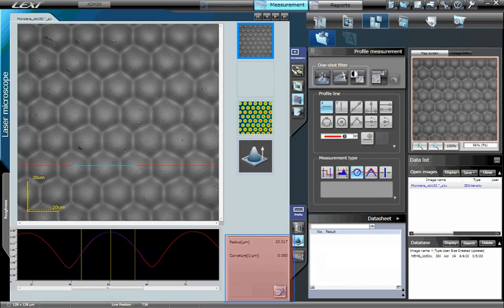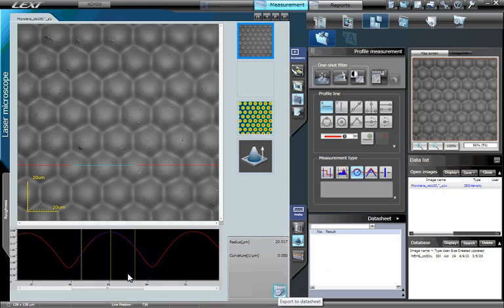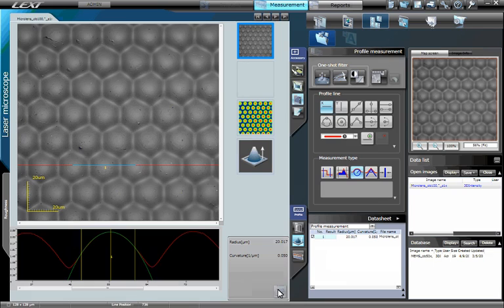The radius and its reciprocal value curvature are displayed and updated dynamically as the yellow target lines are moved. As demonstrated earlier, click the button Export to Data Sheet to save the data where it can be exported via CSV format, Microsoft Excel, or used in automatic report generation.